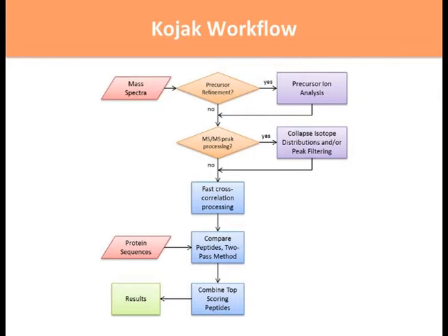Mass spectra go into the algorithm at the top, where the spectra are then refined in several ways. So this pre-processing occurs, and this is a way to clean up the data as best as possible and transform it into a way that allows for fast analysis. Once those spectra are cleaned and transformed, a protein sequence database is added to the analysis, and this is where peptide sequences will be compared to the actual spectra, and peptide spectrum matches made.